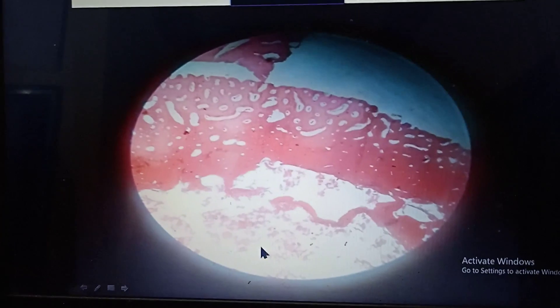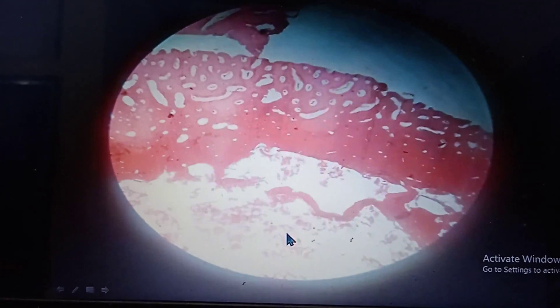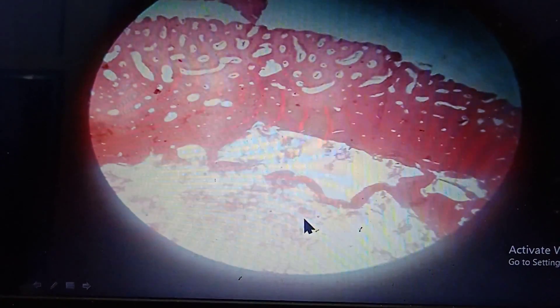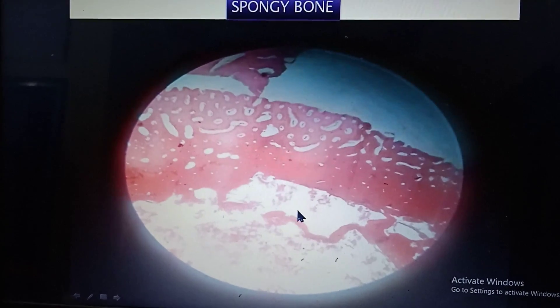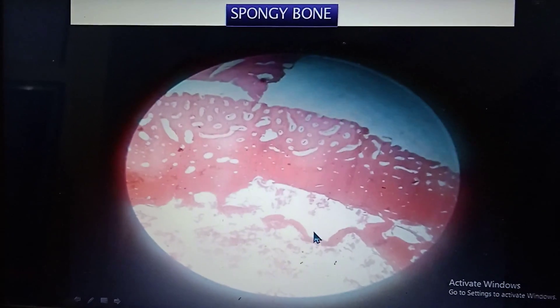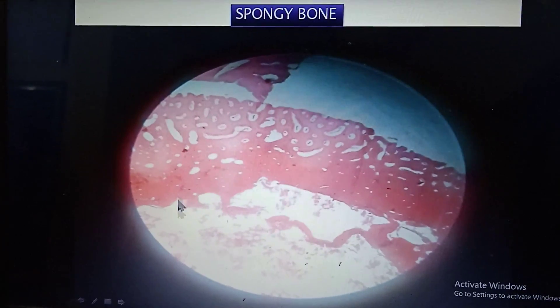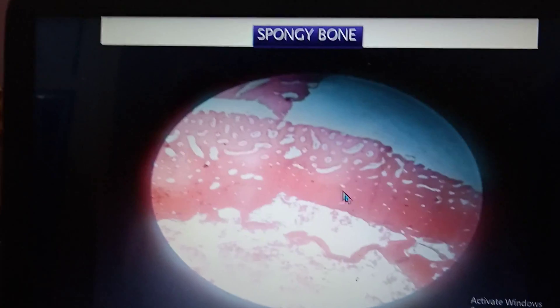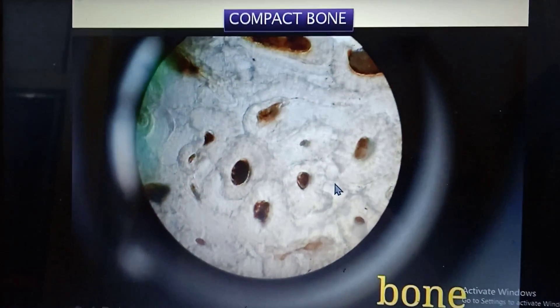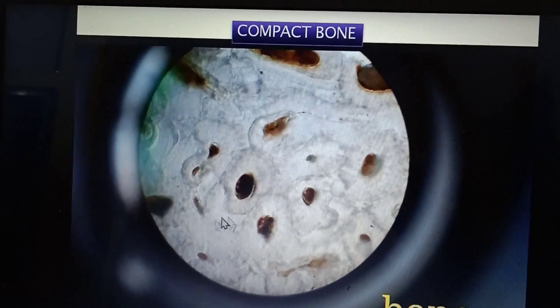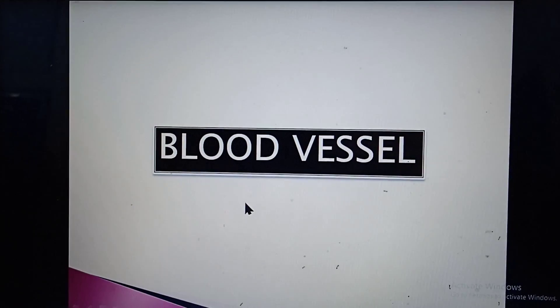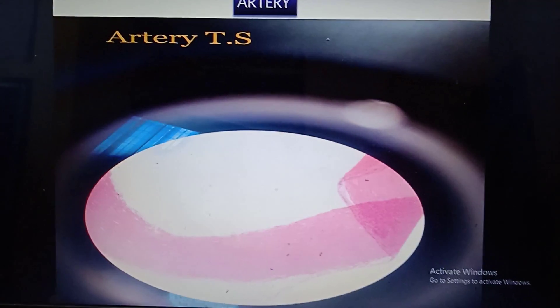Now coming to bone. This is spongy bone, evidenced by the trabecular pattern, and the lacunae are blood-filled. This is compact bone. Both types of bone may be present — you may write spongy bone in the center and compact bone at the periphery. Compact bone is evidenced by the presence of a Haversian system, which is clearly seen in the picture.